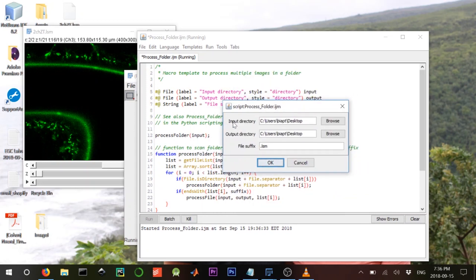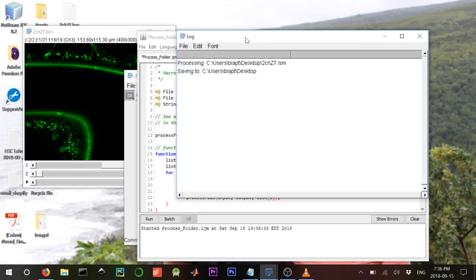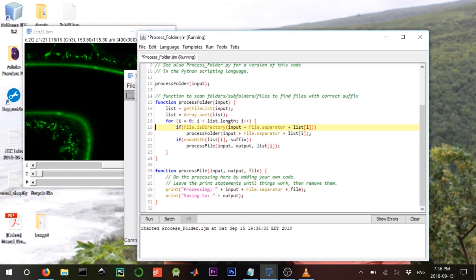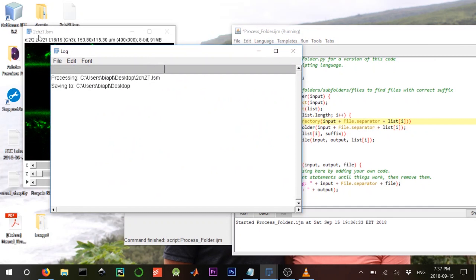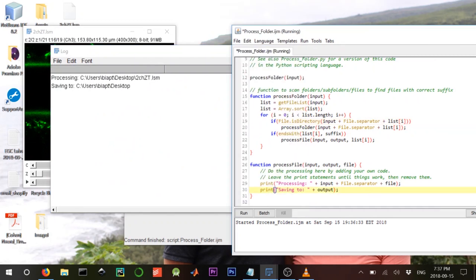Let's run this to see what it does. We have the prompt asking for input directory, output directory, and which files to process. I'll set my desktop as input and output, and target .lsm files. When I click OK, it outputs a string — the path of the current file it's looking at — and the output directory.